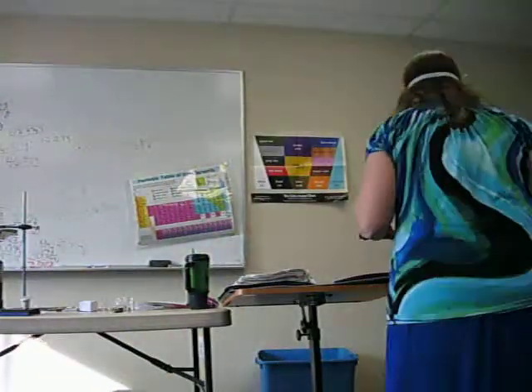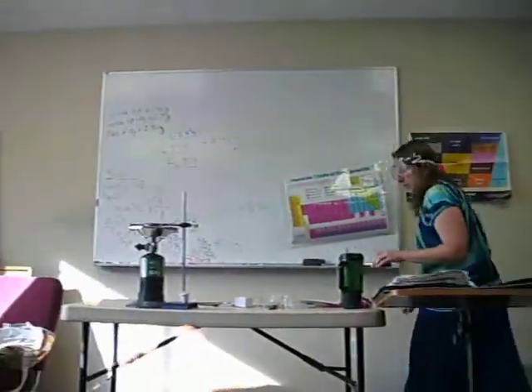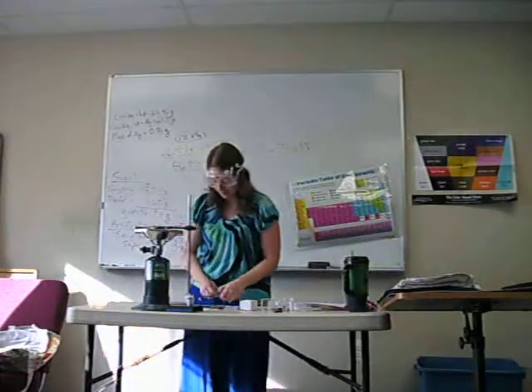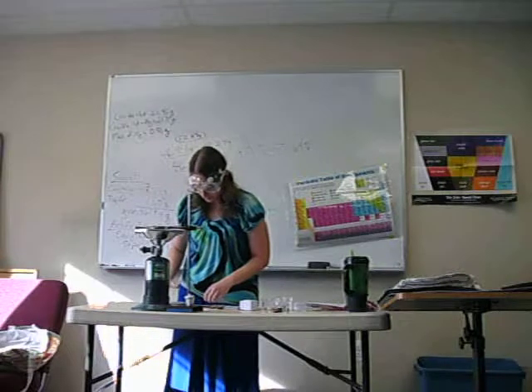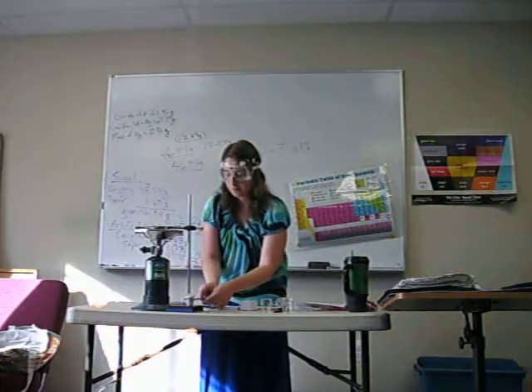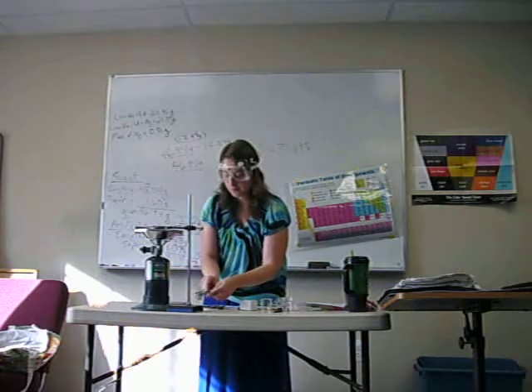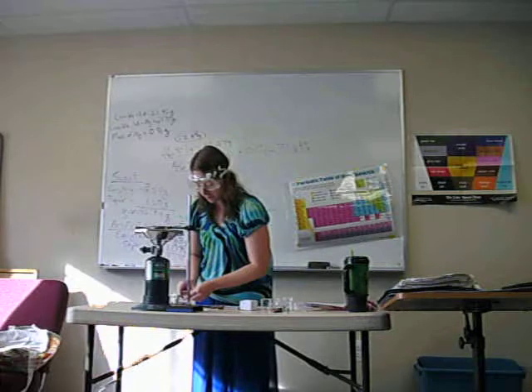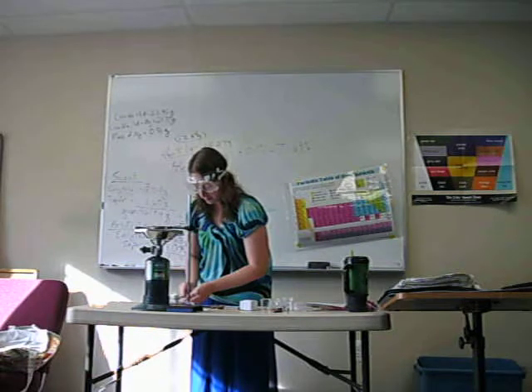All right. If I find my metal scale, I might be able to get the mass here. Moment of truth. Did it work? Okay. So now the crucible lid and the contents, I dropped it on there. Awesome. Let's try that again.